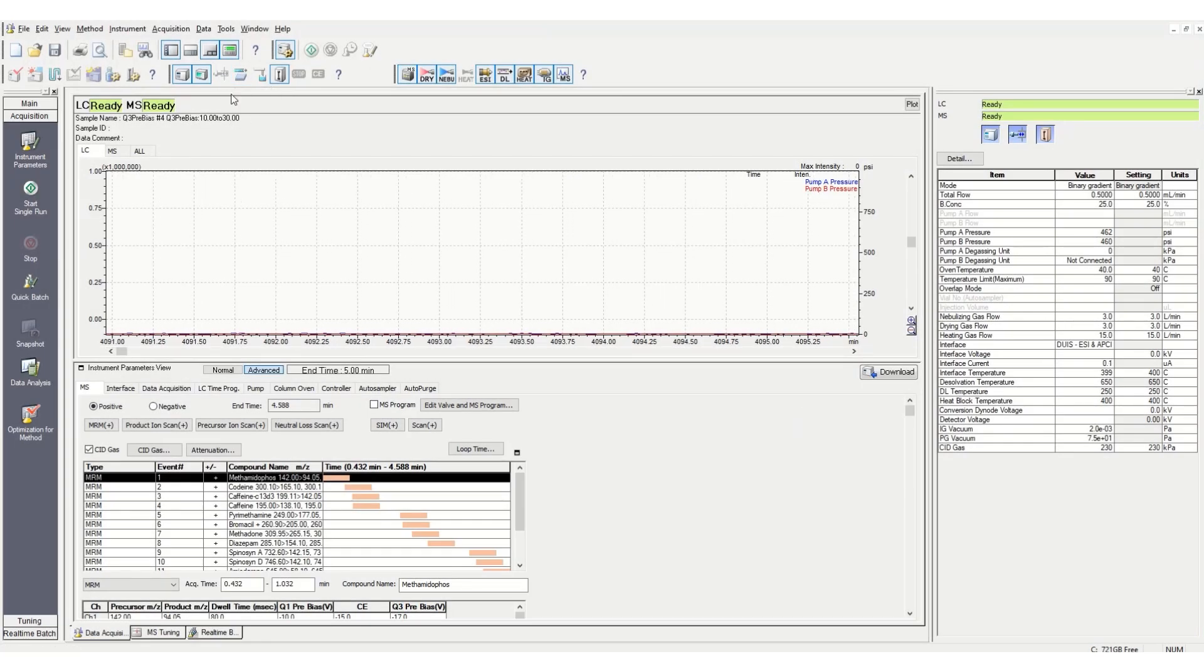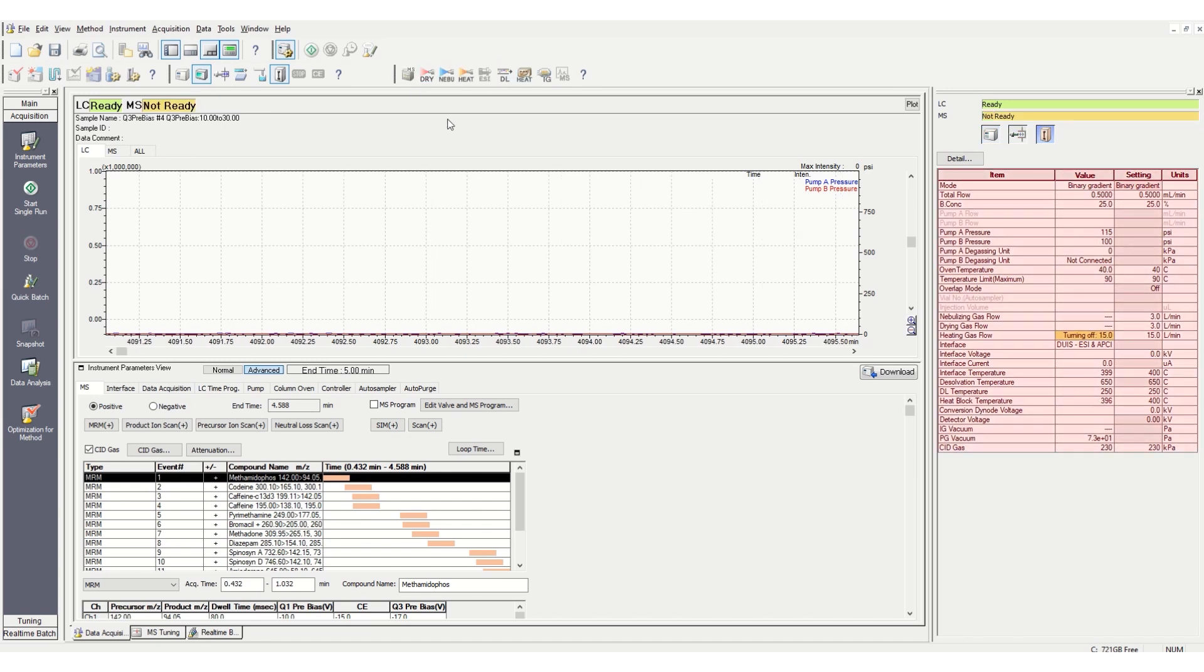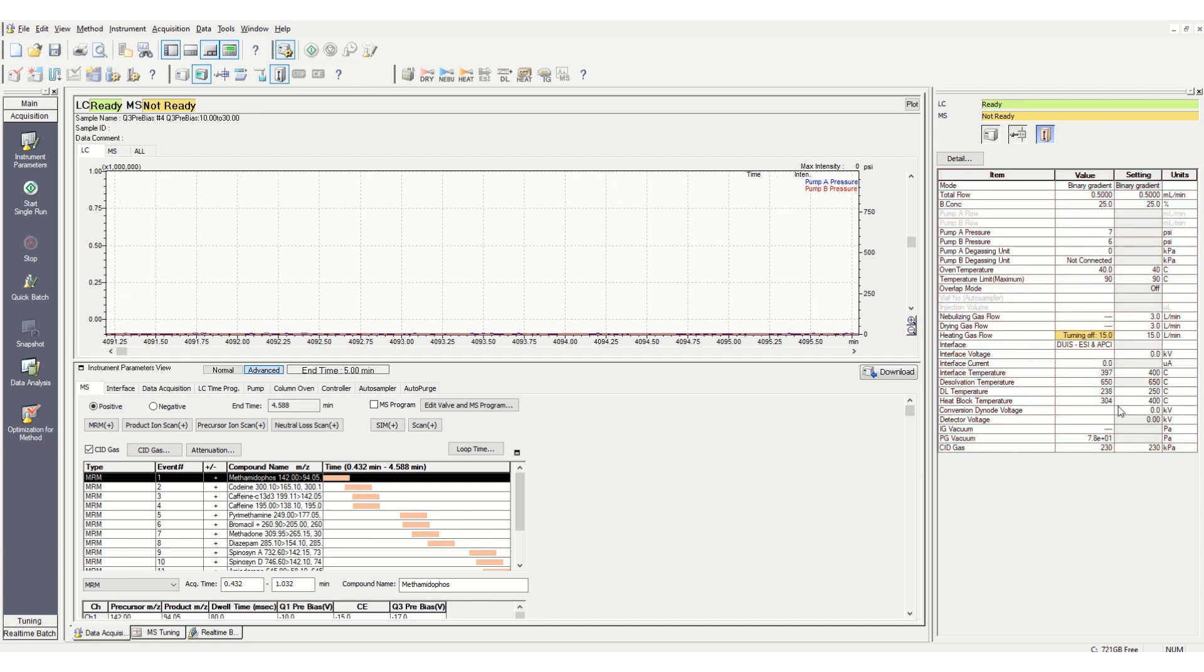First, open Lab Solutions real-time analysis and turn off all gas flows and heaters. You can see the instrument monitor pane. Make sure temperatures have fallen to 50 degrees Celsius before performing the work.